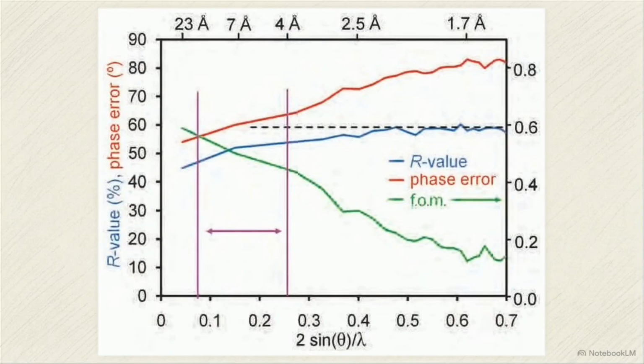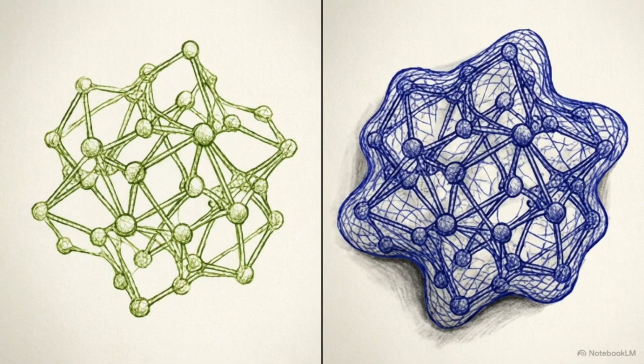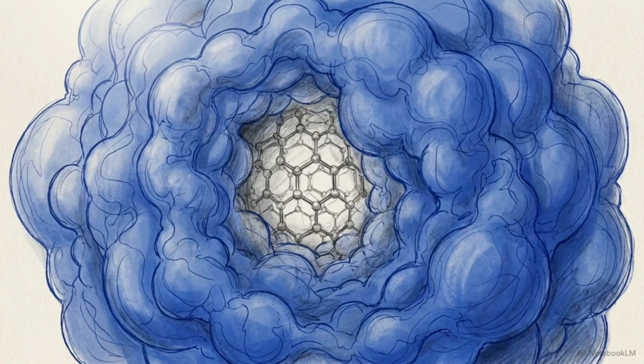This chart tracks a molecular replacement starting model, plotting R-value, phase error, and figure of merit across increasing resolutions. Focus on the red line for phase error. Above a 60-degree error, features become untraceable. Beyond 4 angstroms, starting phases approach random noise. Because phase dominates the math, an electron density map built strictly from an uncorrected search model will reconstruct the incorrect model. It hallucinates its own inputs, completely masking the true physical structure of the protein.